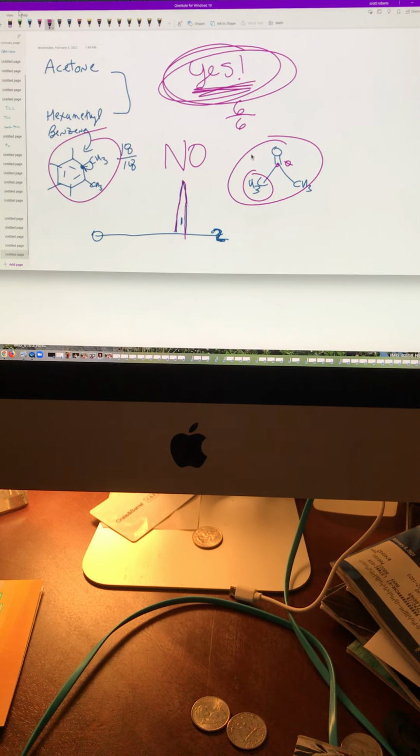No. You cannot use proton NMR. But you can use carbon NMR. We're going to talk about that right now. That was a transition into carbon NMR. So no, not no, but hell no. You cannot use proton NMR, but you can use carbon. So let's do it. Don't forget about mass spec. I've got to hurry up and do mass spec.